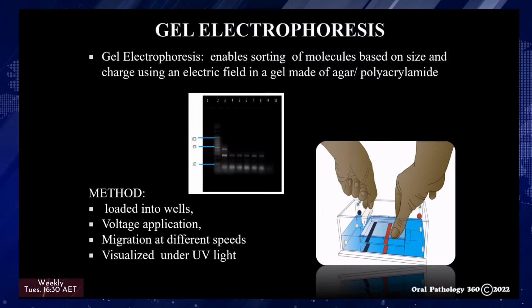Be aware that DNA will diffuse within the gel over time. An examination or photography should take place shortly after cessation of electrophoresis. Fragments of linear DNA migrate through agarose gels with a mobility that is inversely proportional to the log of their molecular weight. As the voltage applied to a gel is increased, larger fragments migrate proportionally faster than smaller fragments. For that reason, the best resolution of fragments larger than about 2 kb is attained by applying no more than 5 volts per centimeter to the gel.